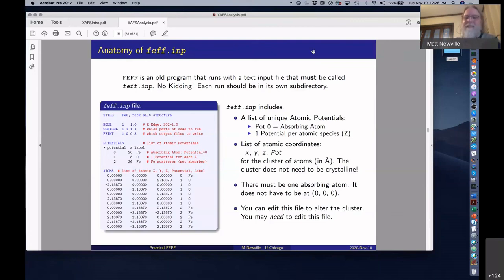Okay, right. So another question, but to me, it's more instrument related. Sometimes two samples have the same oxidation state and the same XANES profile, but their edge shift is different from one measurement to another. So what does result in different E0 values? To me, it's rather the instrument error, and E0 will be different. Just correct me if I'm wrong.